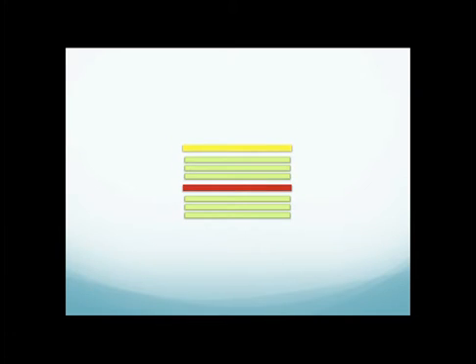And now we're going to do the electrotransfer process. In this process, you're going to make a gel sandwich. You will have 3 filter papers soaked in transfer buffer, shown here in green. Then you're going to put your gel and SDS page together, shown here in red. Then you'll add another 3 filter papers, also soaked in transfer buffer. And finally, you put a sponge, shown here in yellow.